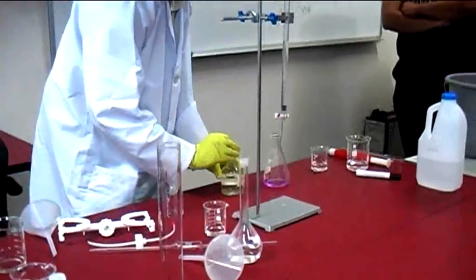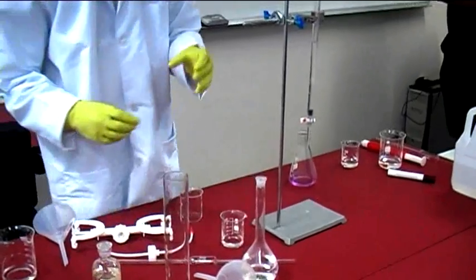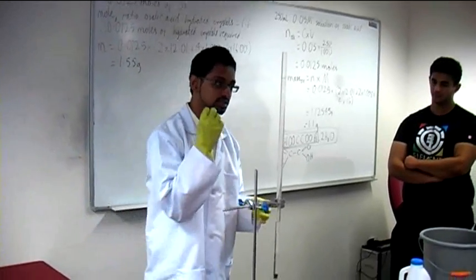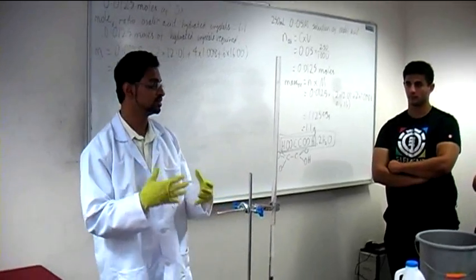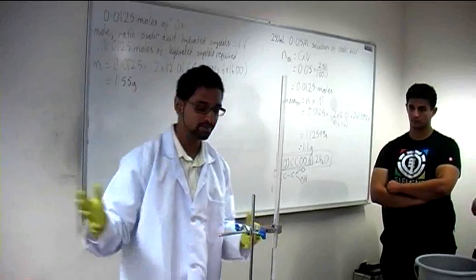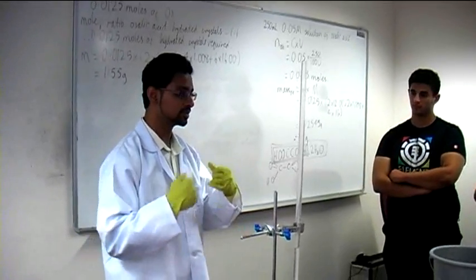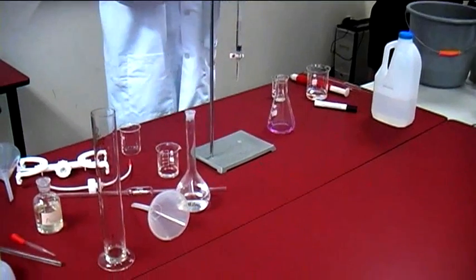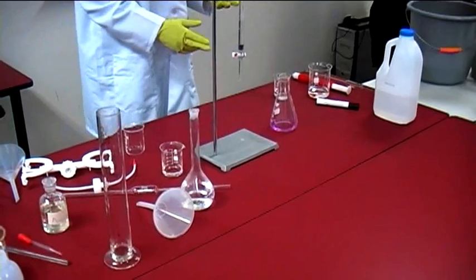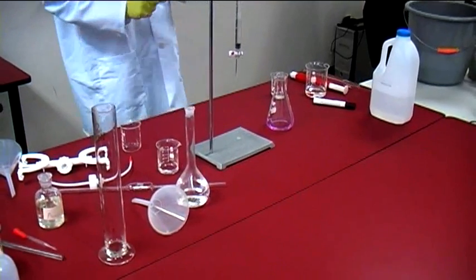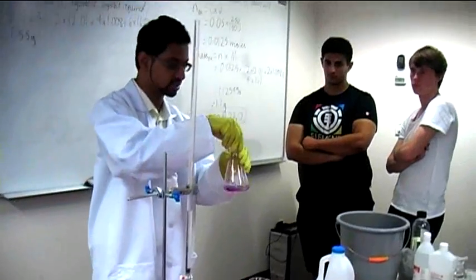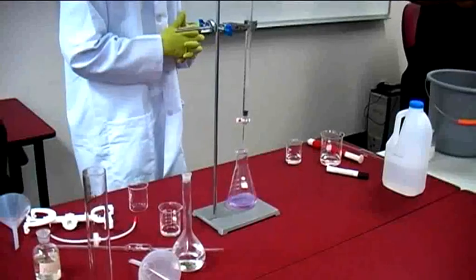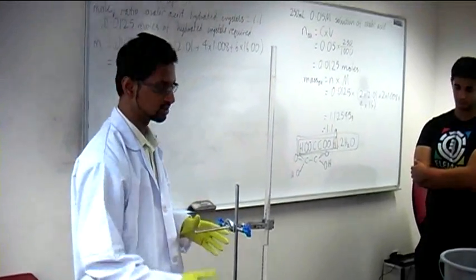The solution here is NaOH, and our aim in this titration is to work out its concentration. We're going to do that by neutralizing it with an acid — in this case oxalic acid. We know the exact concentration of the oxalic acid because we made the solution from scratch, weighing approximately 1.55 grams and calculating the moles and concentration. Now we'll do a neutralization reaction between oxalic acid and sodium hydroxide, measuring how much oxalic acid is needed using this burette, with 20 mL of sodium hydroxide in the flask.